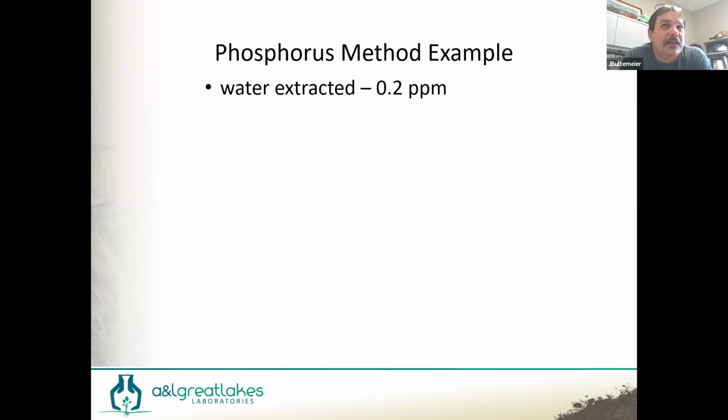So here's how the methods are different. Now this is a list of all the methods. This is the master list out of the book and one or two extras. And I want you to see how the numbers vary. So if I took a given soil sample, any standardized soil sample, just one, and I ran it through all of these different methods, what would the answer look like? What would the resulting data come out?